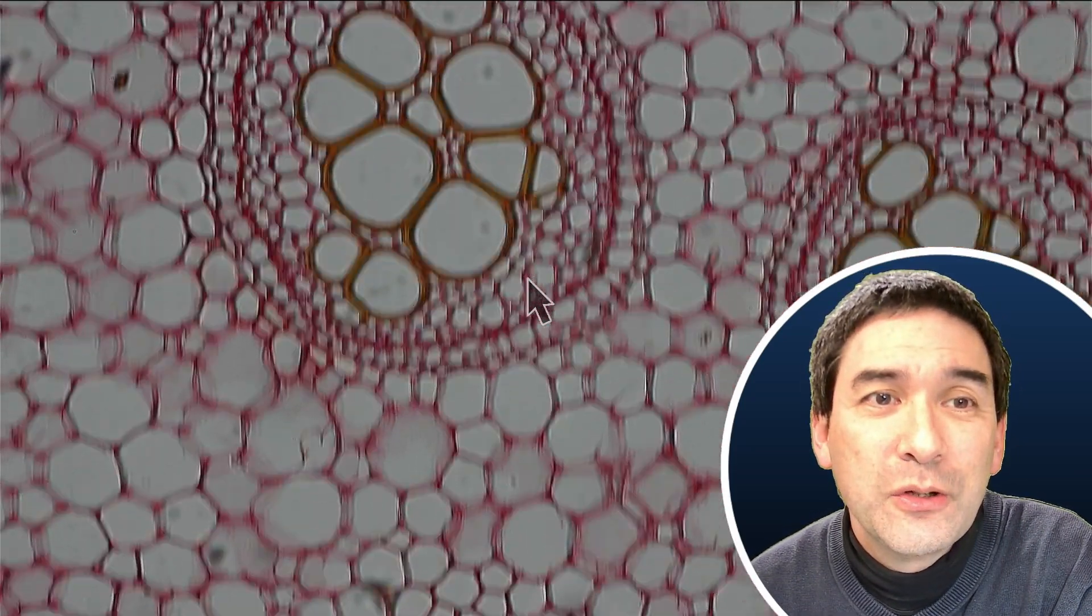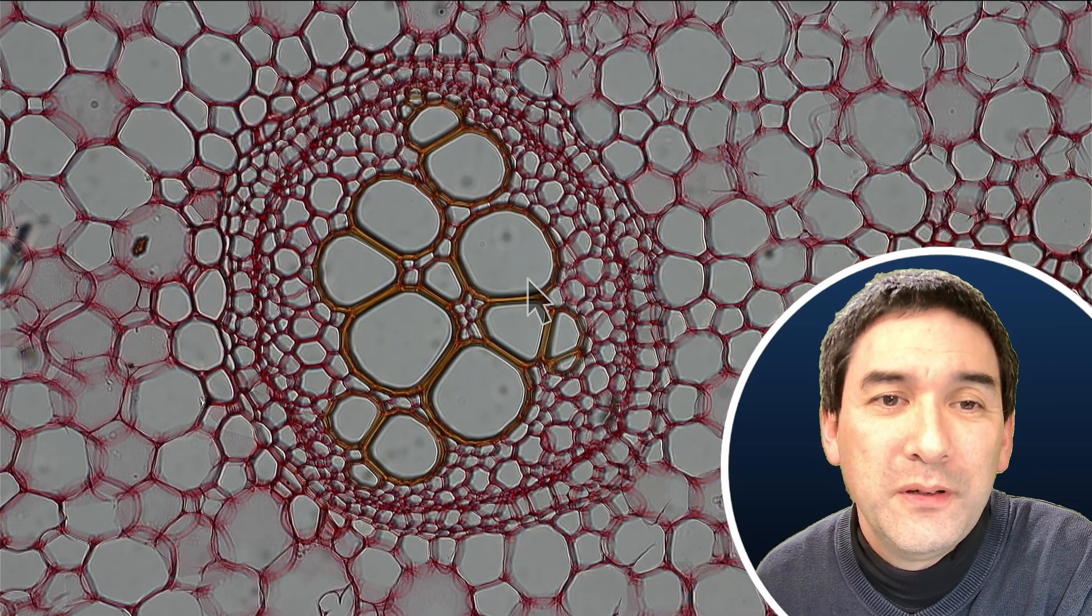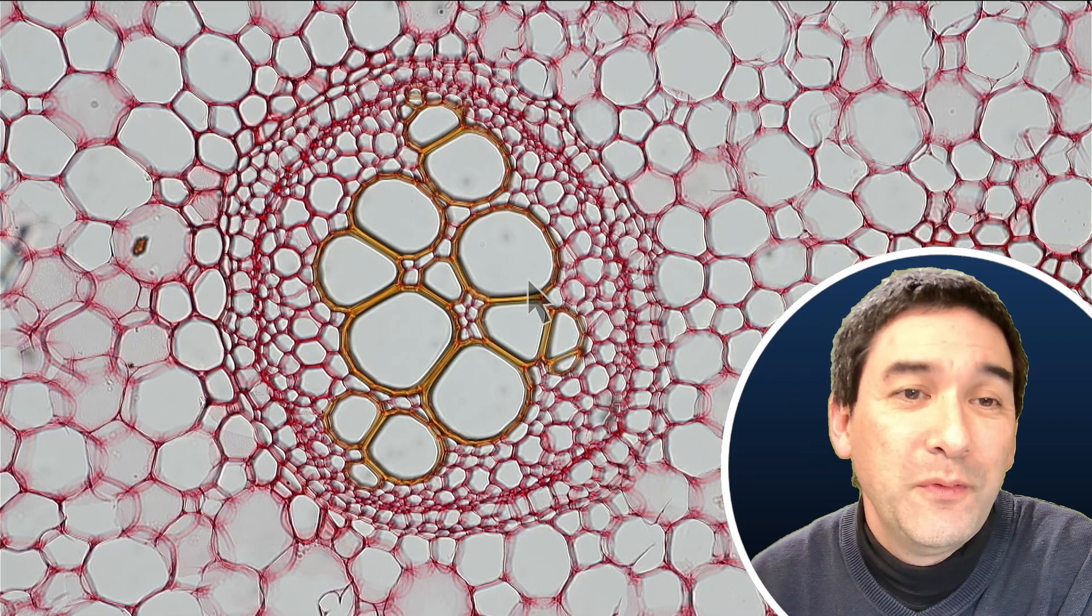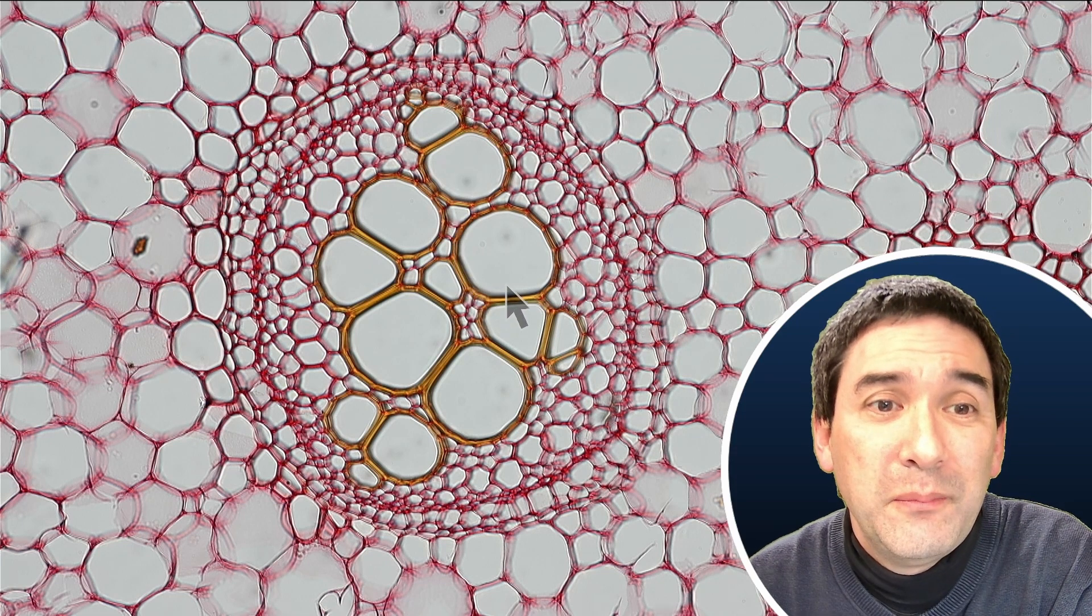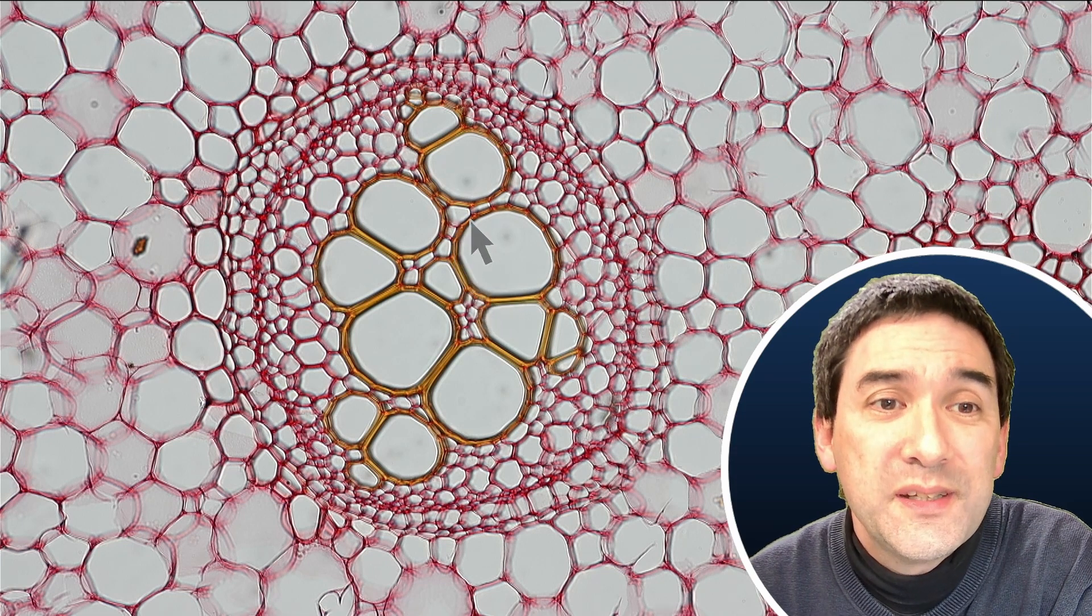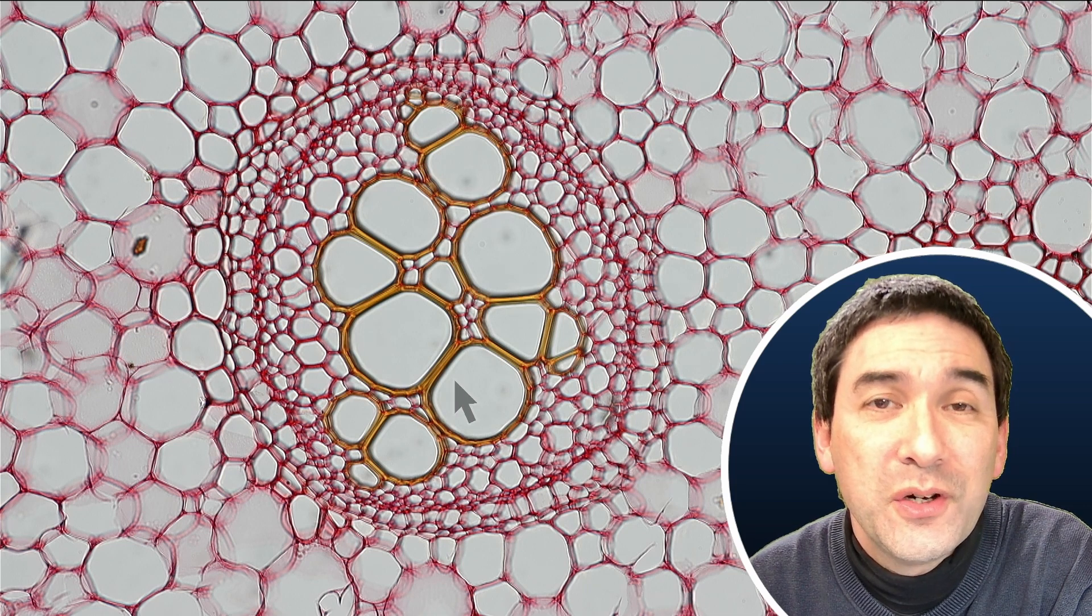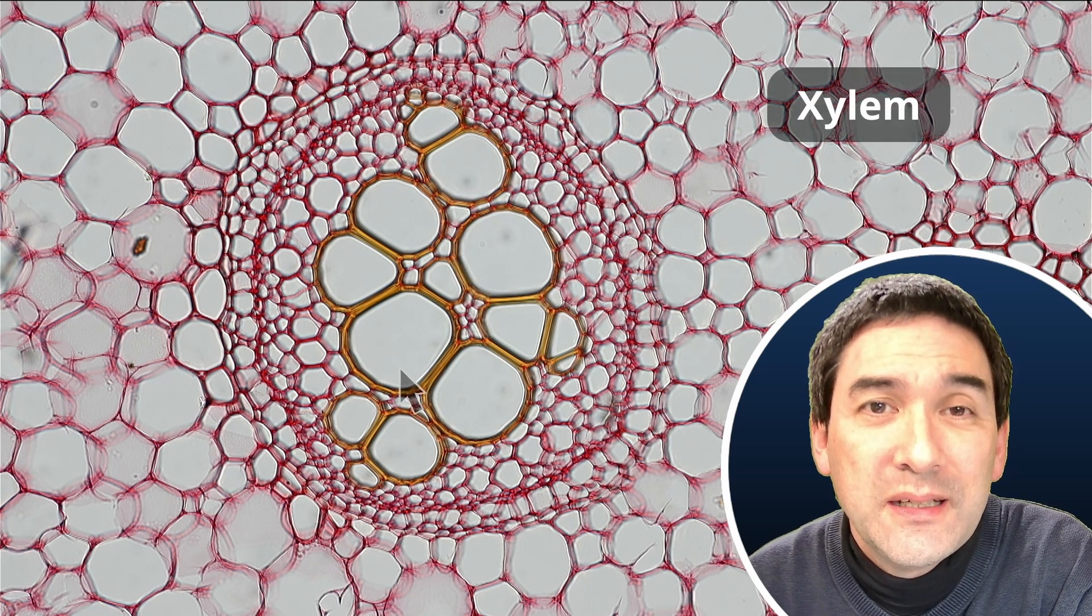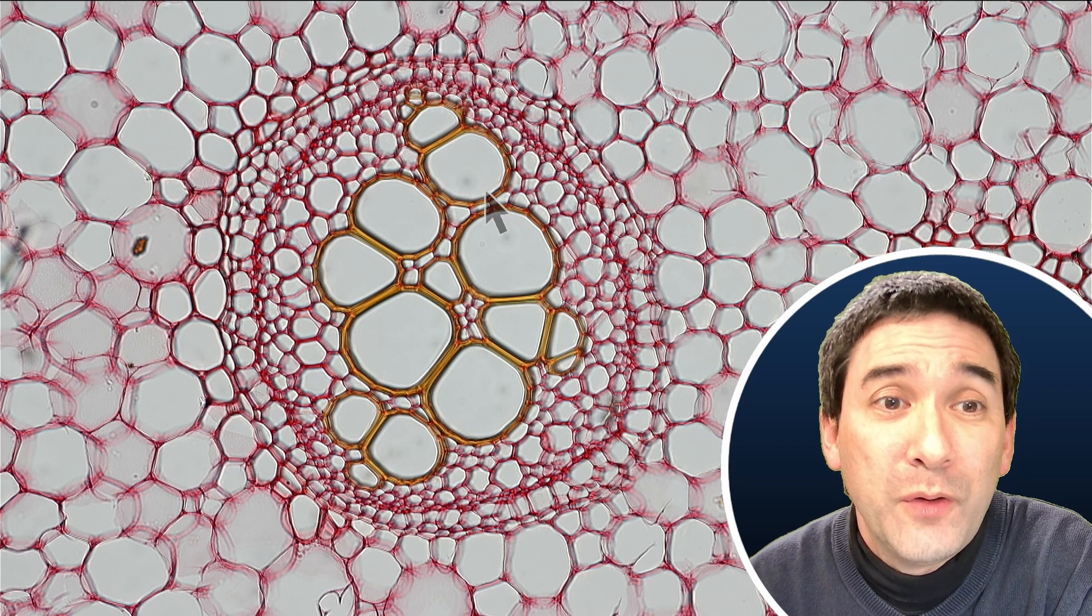So now let's have a closer look at one of those vascular bundles that we have over here. And we can already see that some of the cells there, let me open the condenser a little bit more here, and you can see that some of the cells here are fairly large, like those over here. You have also a fairly thick wall, the cell wall here. And these cells here are referred to as the xylem. The xylem are those cells that transport water and minerals from the roots up to the leaves of the fern.